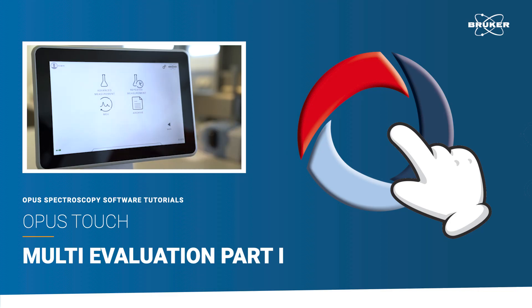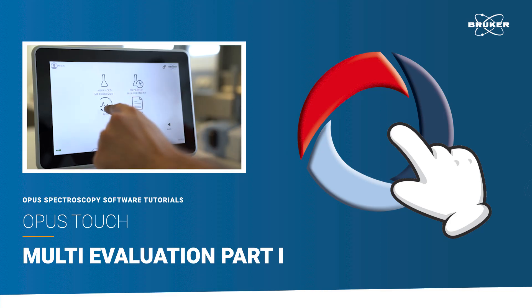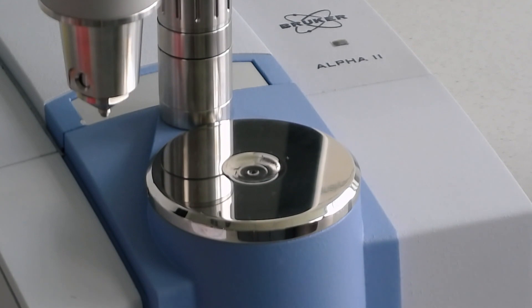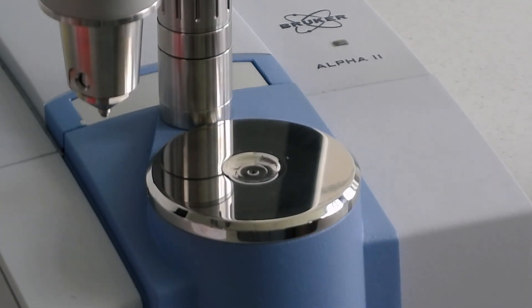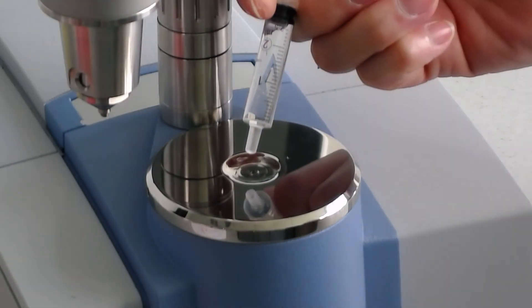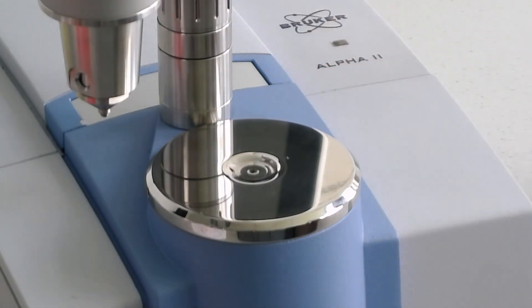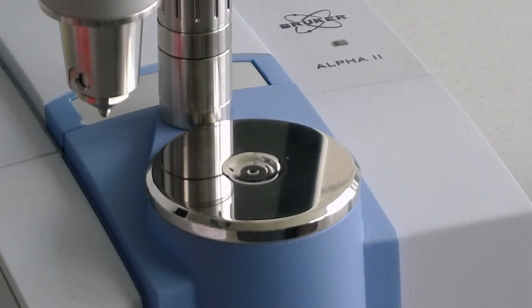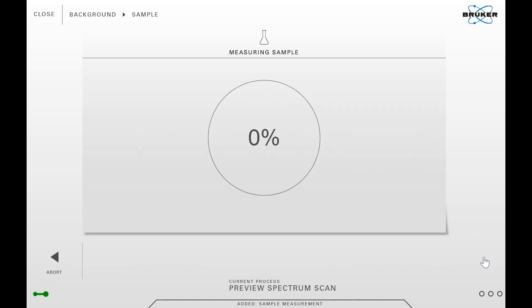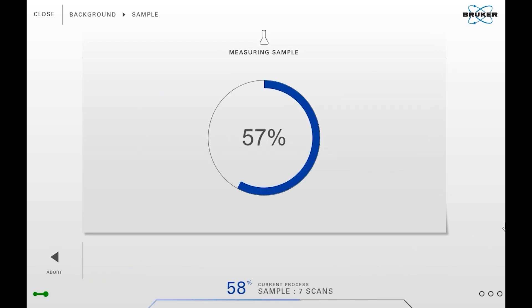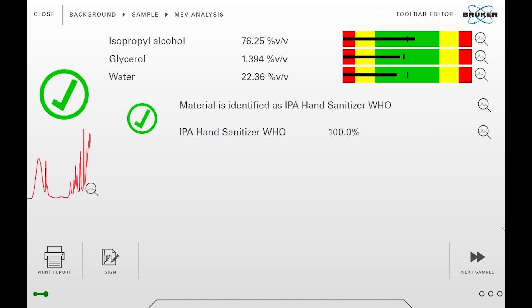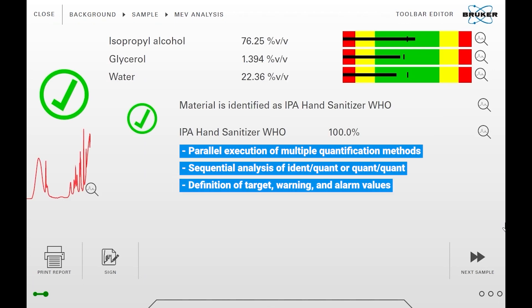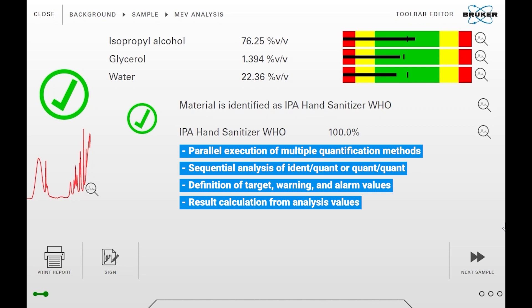Hello and welcome to the first multi-evaluation method tutorial. The multi-evaluation workflow efficiently analyzes your sample in great detail. It enables simultaneous running of multiple identification or quantification methods or a sequential workflow that follows a certain hierarchy.